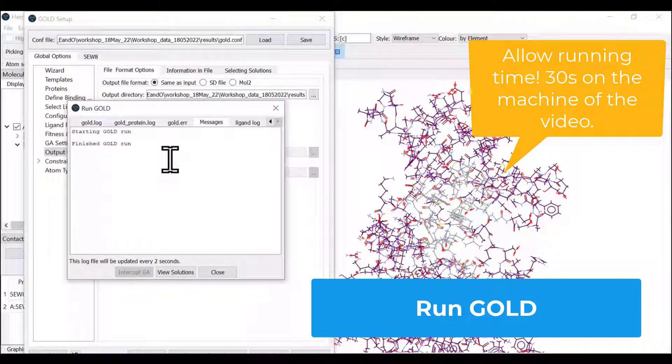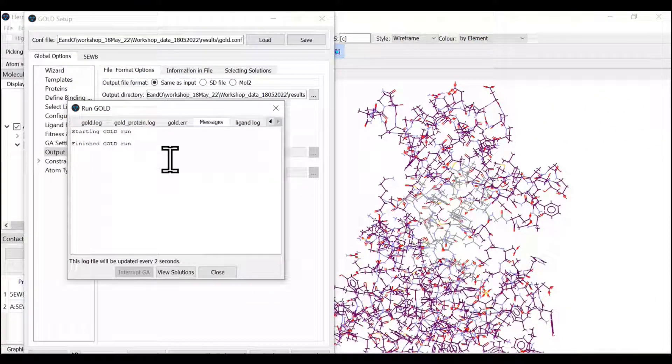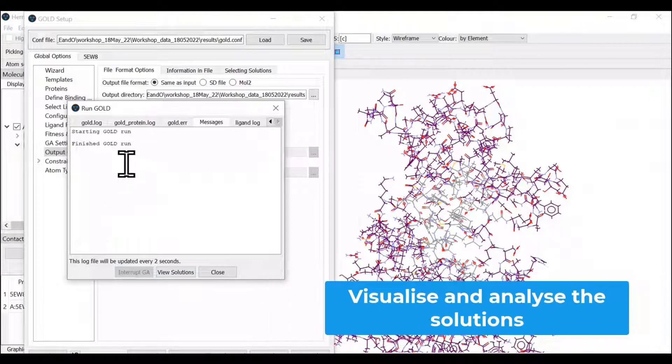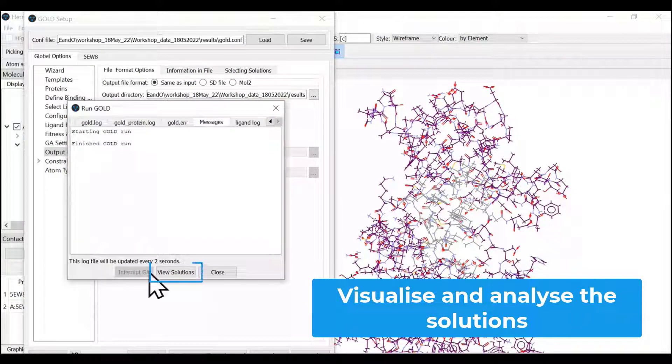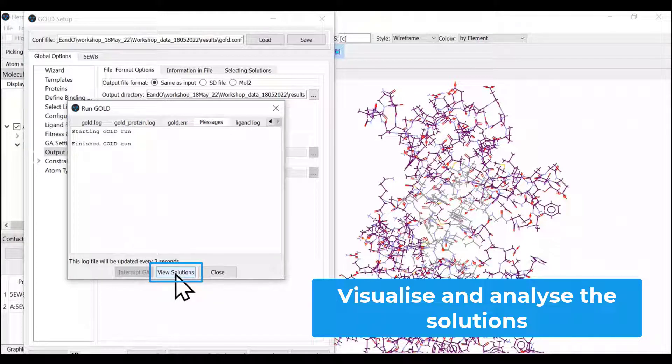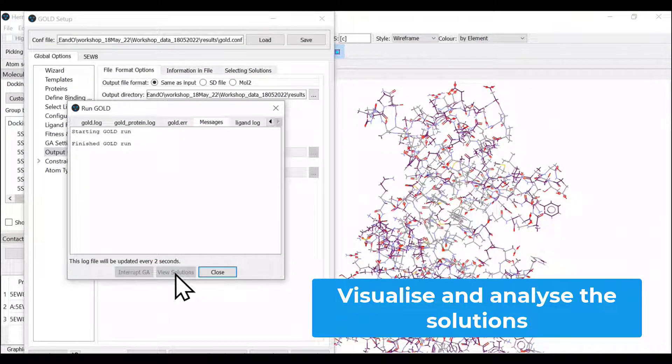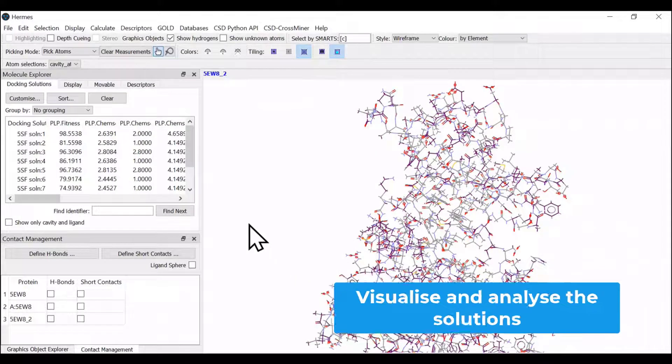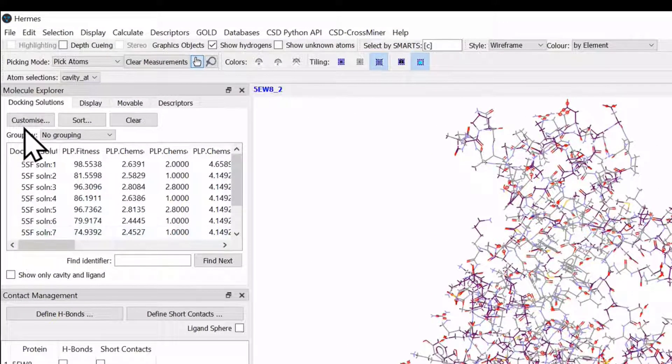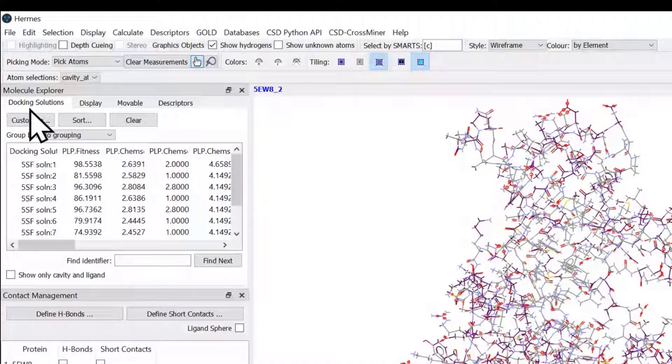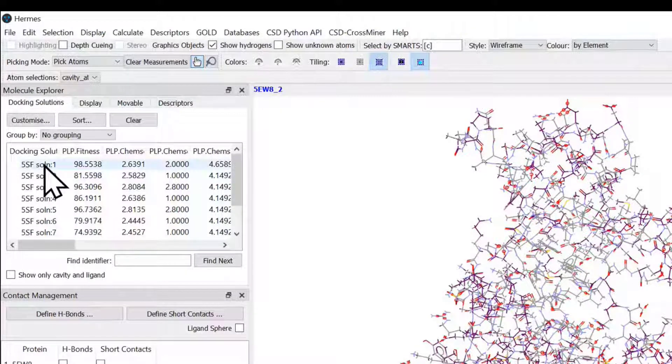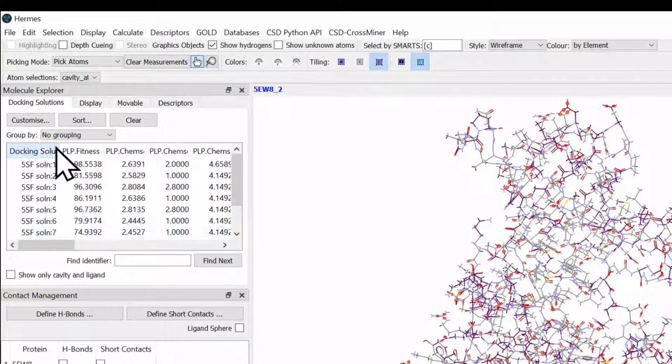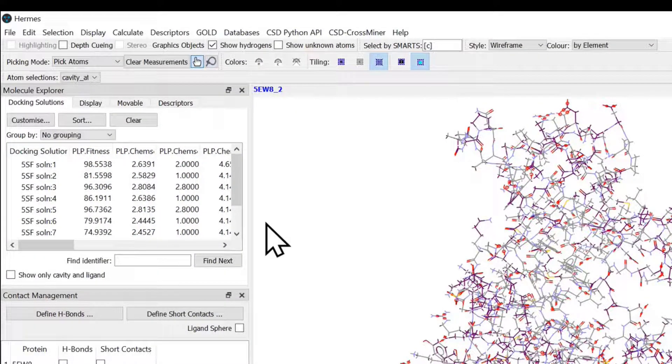We have finished this docking calculation and we are going to see the solutions. Once the finished GOLD message pops up, the view solution button is available to click. We click this button and safely close the setup. In the left hand side, we have a new tab in Molecule Explorer which mentions that the docking solutions are available for our analysis.